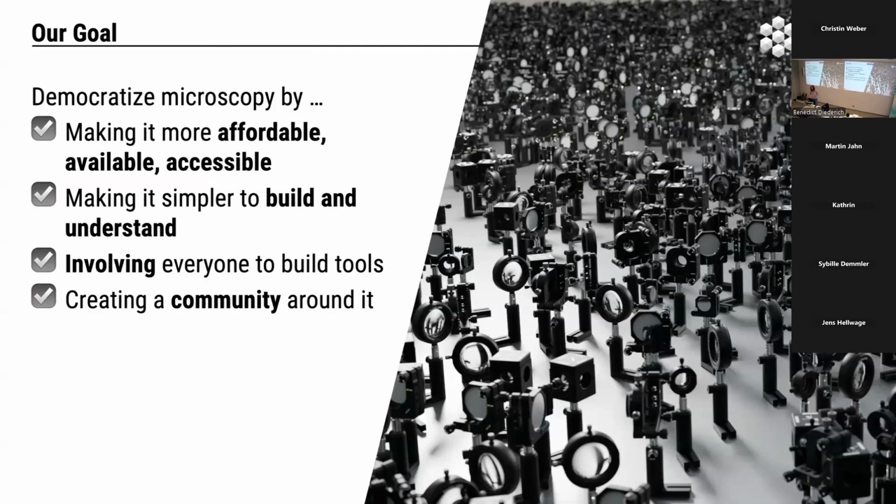It's quite complicated and only very few companies are building it. So involving the community by default is pretty difficult because you don't have access to these tools. And making the tools understandable if you don't have them is also difficult, because sometimes you need to experience them. This is basically the main motivation why we have created this modular system.